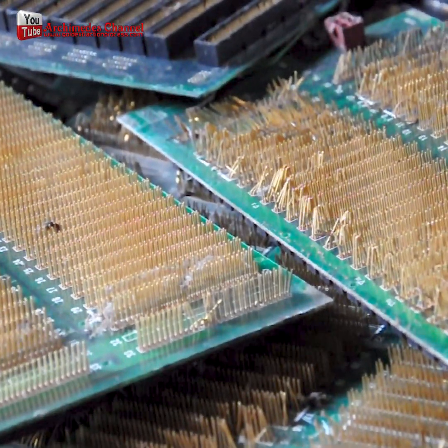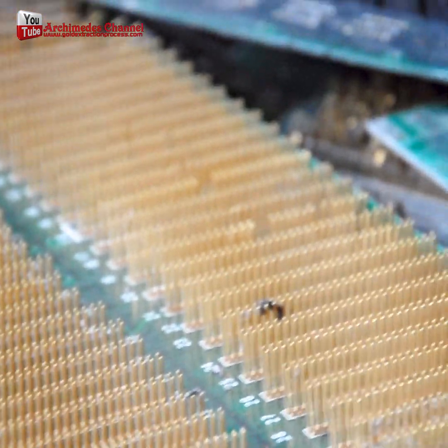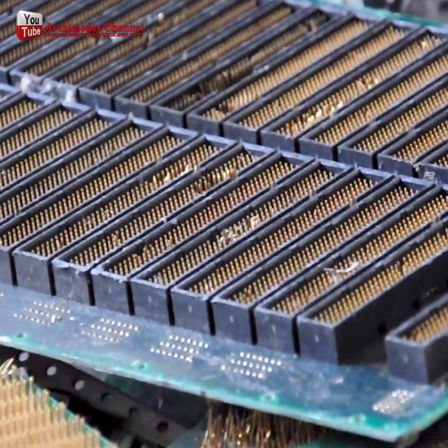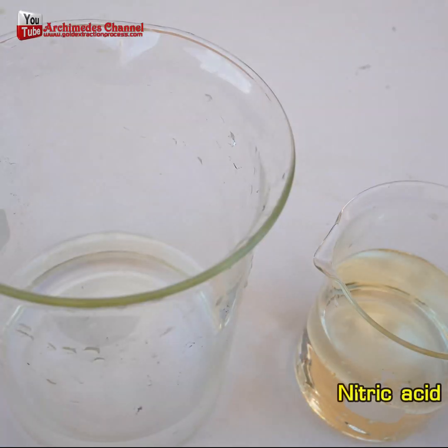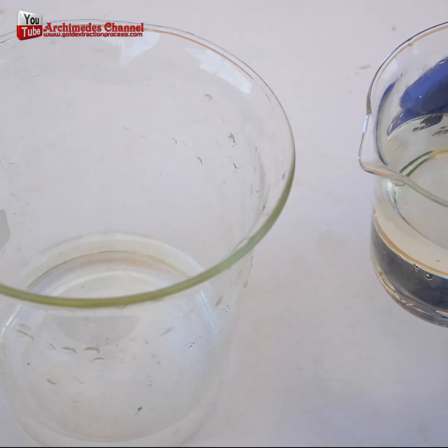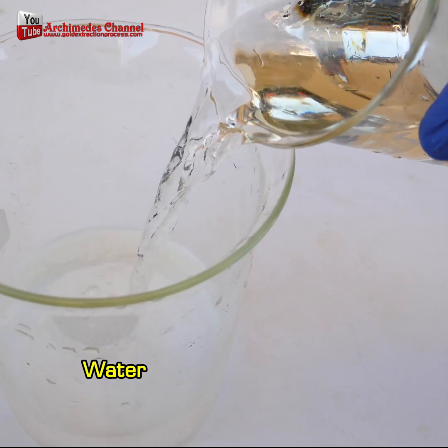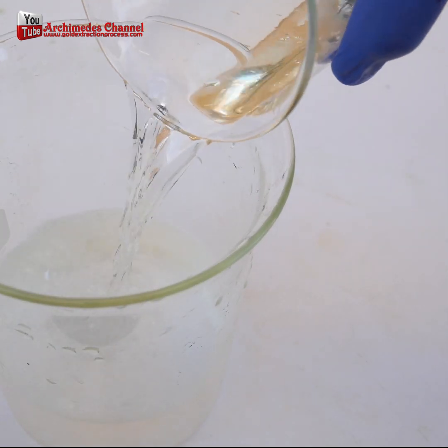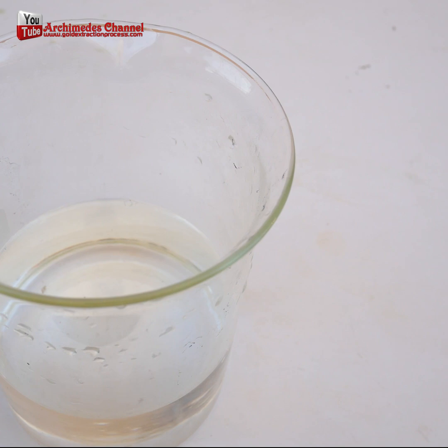Gold recycling: how to recover gold from electronic circuit board scrap. In this video, we're going to show you how to recycle electronic circuit board scrap into gold. By following these simple steps, you'll be able to recover a large amount of gold from your scrap. Use 68% nitric acid mixed with water in a one-to-one ratio to separate gold from old circuit boards.